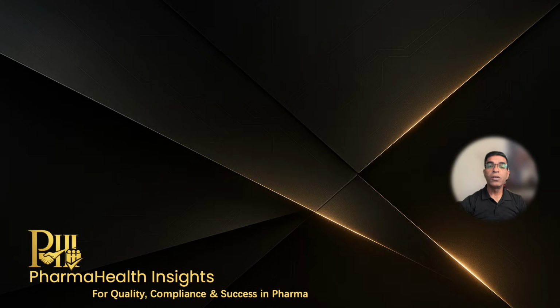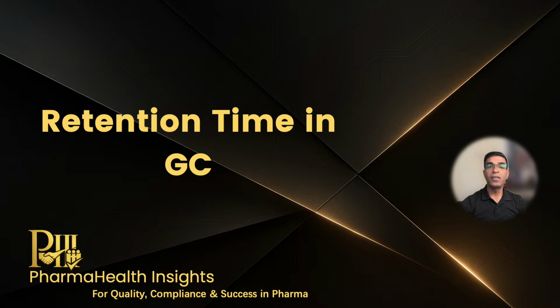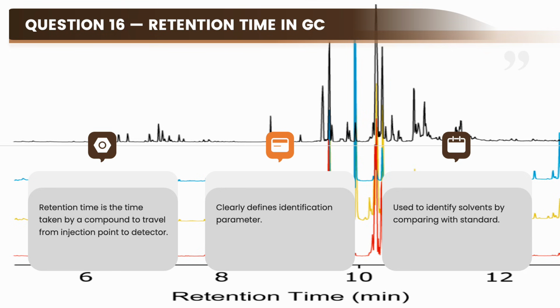Now the interviewer would like to know how compounds are identified in GC. So the next question will be, what is the retention time in gas chromatography? You should answer like this. Retention time is the time taken by a compound to travel from the point of injection to the detector.